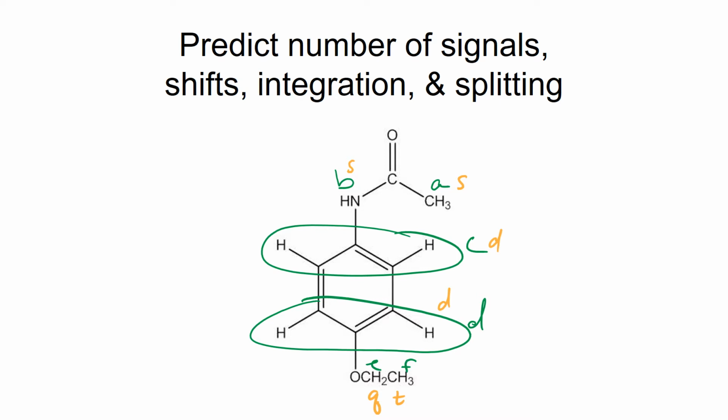And we know that the aromatics are going to show up between 7 and 8 ppm. The NH group is going to be easy to tell because, like an OH group, it will look broadened. So we're going to look for a signal by itself that looks a little wider than the other ones. And then we have a singlet methyl group that should be pretty easy to tell.